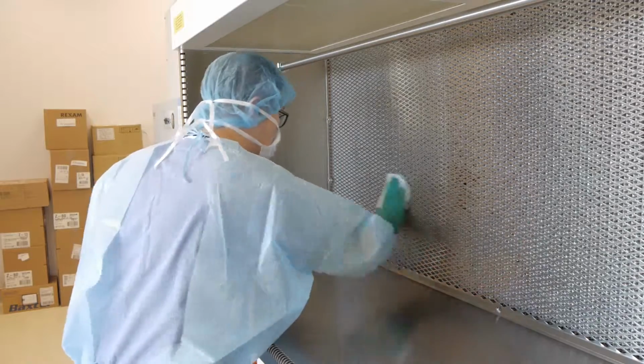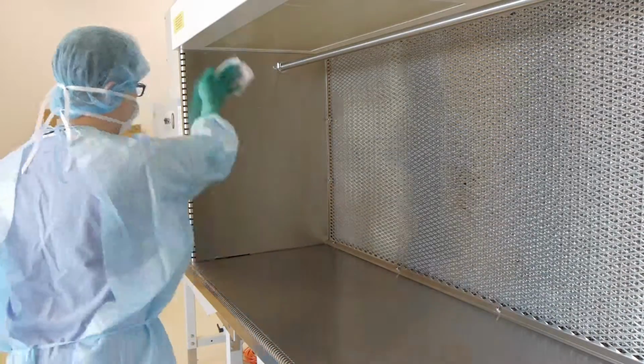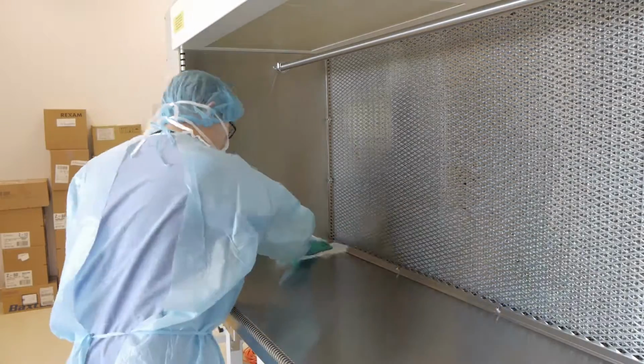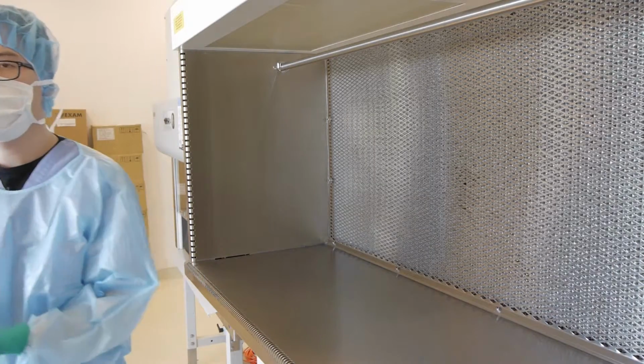The order you clean the hood matters. First, start with the ceiling, then the back, followed by the sides, the pull, and lastly, the working surface. After hood cleaning is complete, sterilize your gloves again with alcohol. Remember that you must clean the working surface again prior to each compounding procedure.